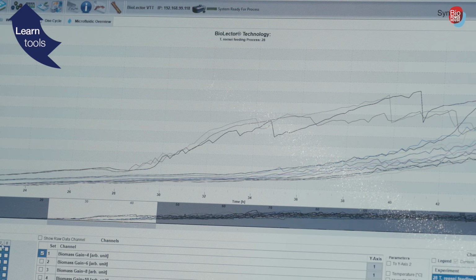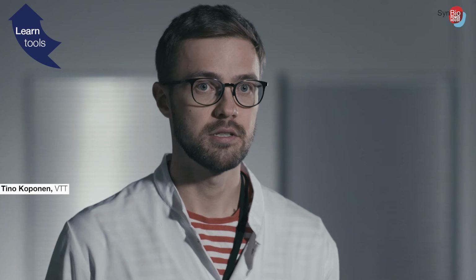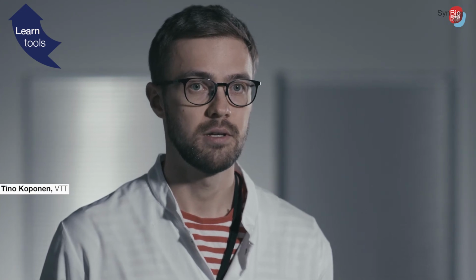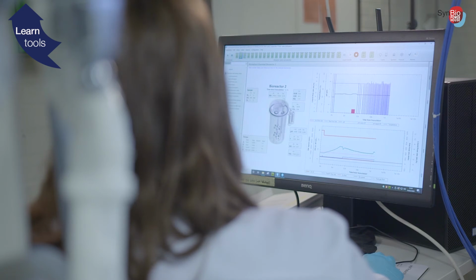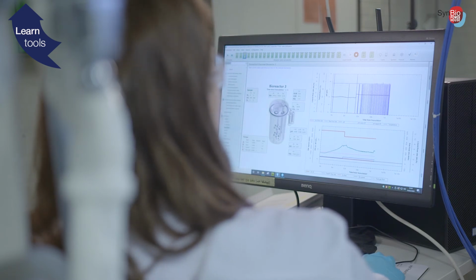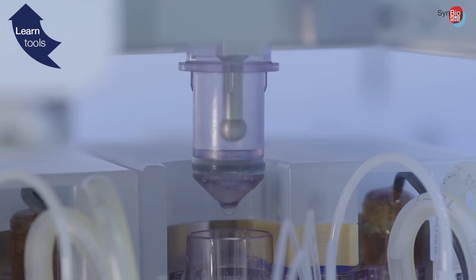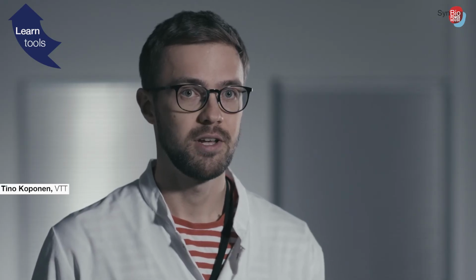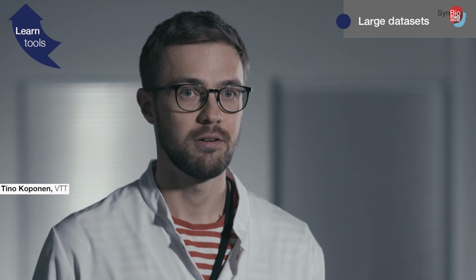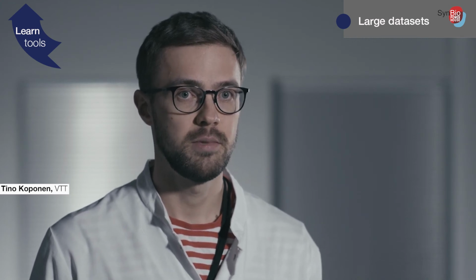And then if we go to the larger scales, we can measure various things from the same experiment. So for example, in the Amber system, we can measure all the things that you can measure from a traditional bioreactor, and we can also take the samples automatically. So we can have a sample every hour for, let's say, 7 days. So we can also there gather a large pool of data that we can then utilize in the DBTL cycle.